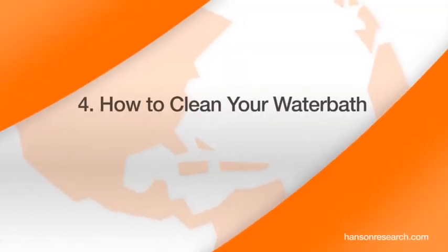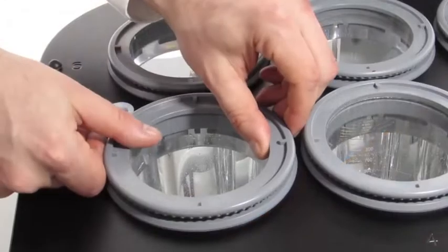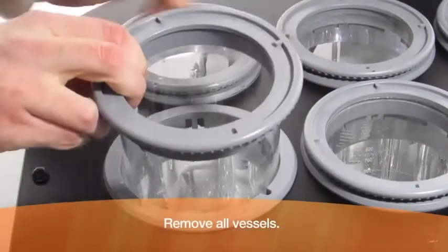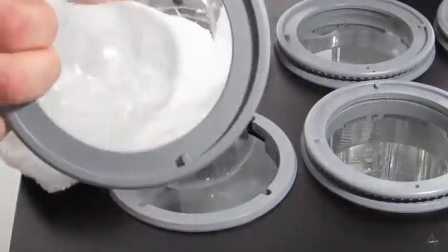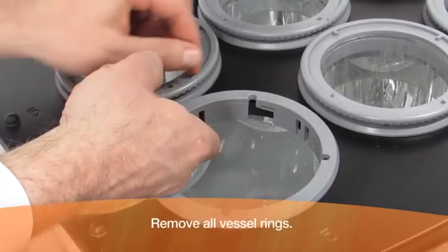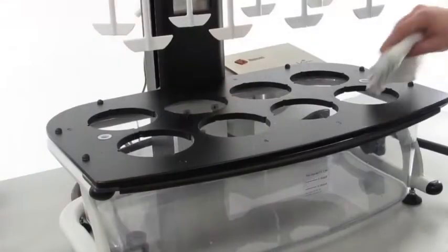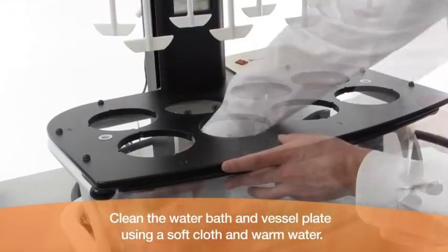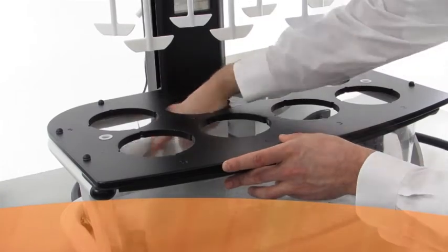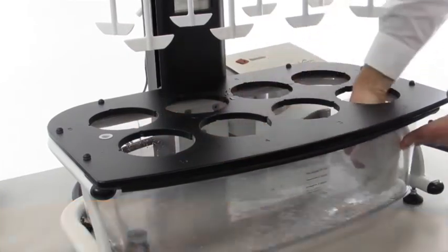How to clean your water bath. Remove all vessels. Remove all vessel rings. Clean the water bath and vessel plate using a soft cloth and warm water. Do not use chemicals or abrasives of any kind.